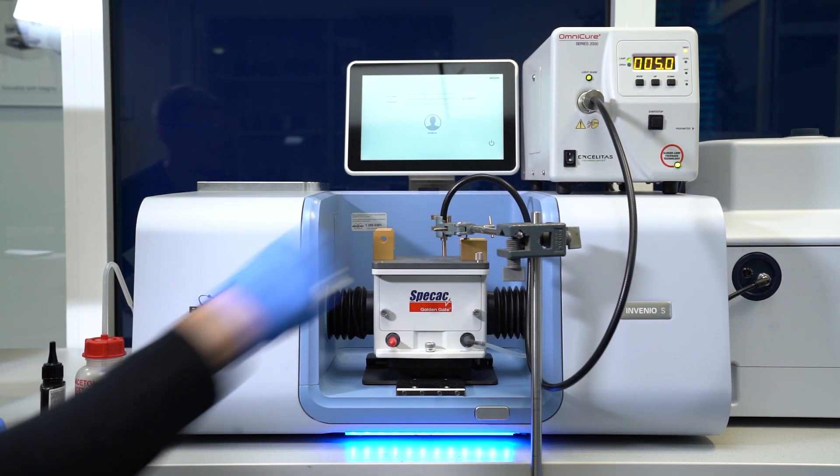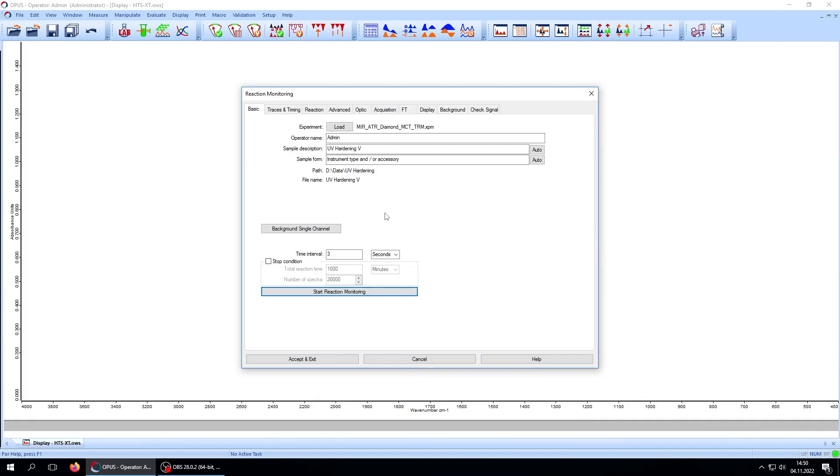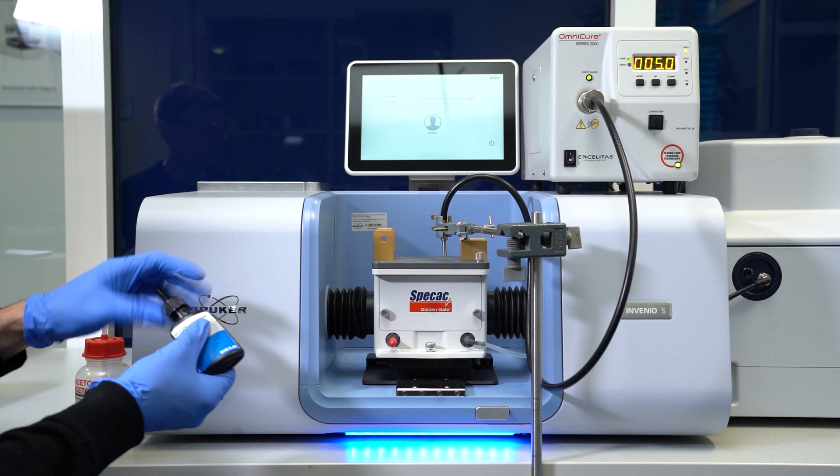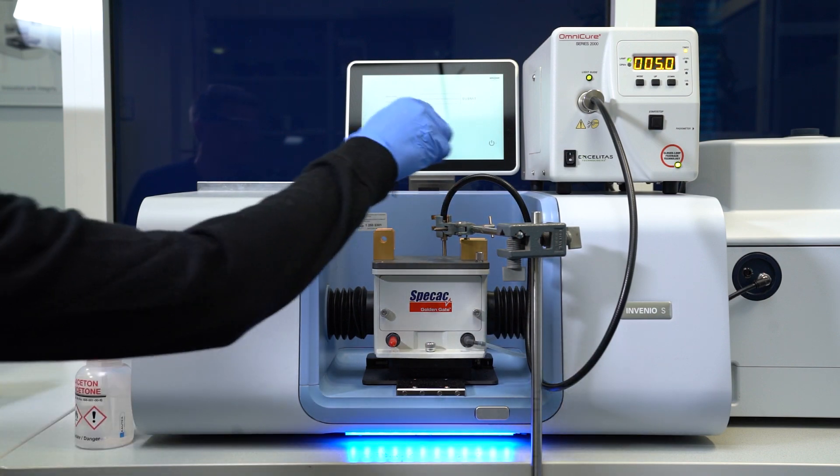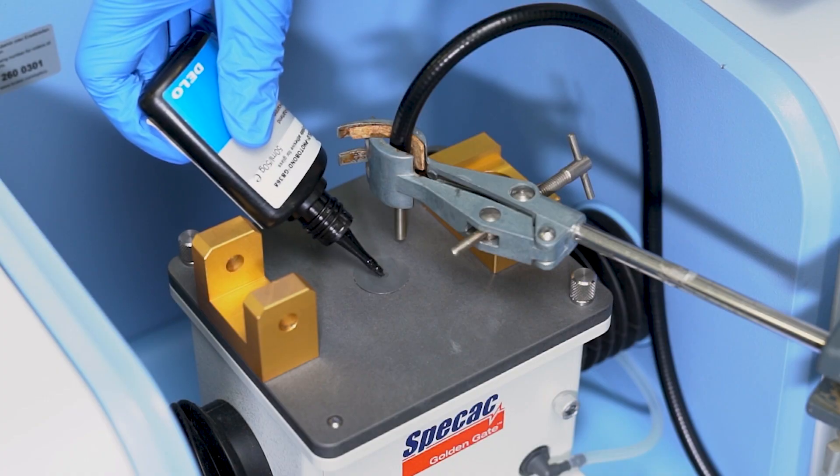Next, we measure a background spectrum to compensate environmental effects. After that, we introduce the adhesive to the ATR crystal and start the measurement.